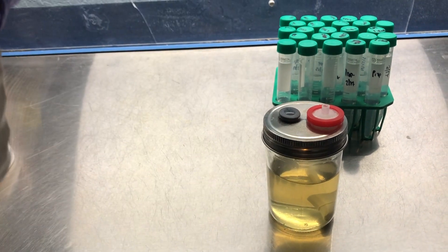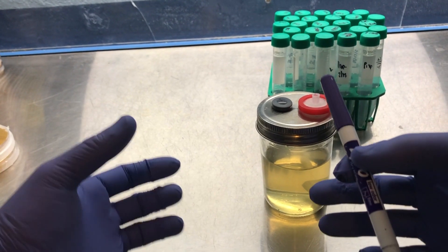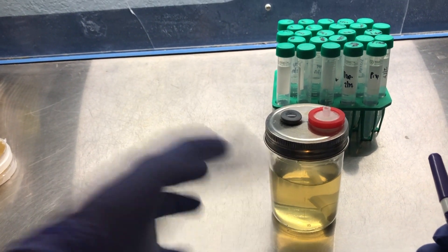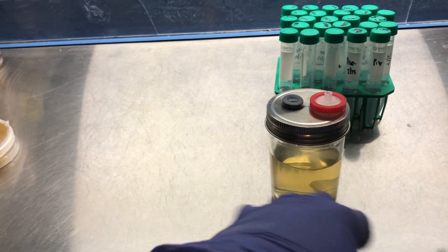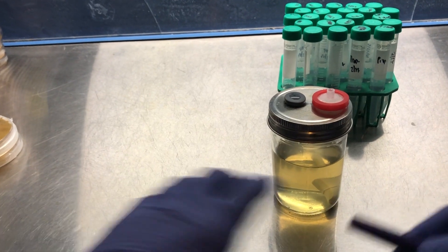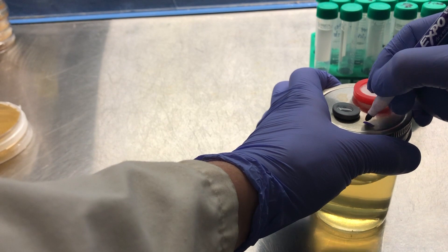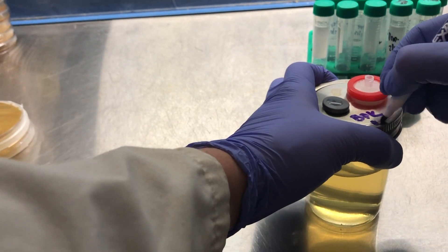And as that stir bar spins on the stir plate, those germinated spores will interact with each other and hopefully they'll create some new strains, some new genotypes. Then we'll put that into grain and then grow it out till fruiting. We can go ahead and label with the strain and date.